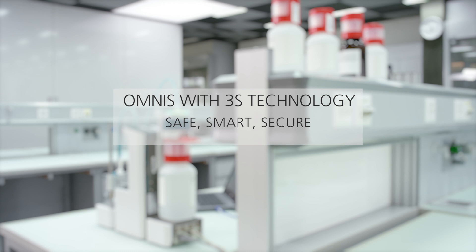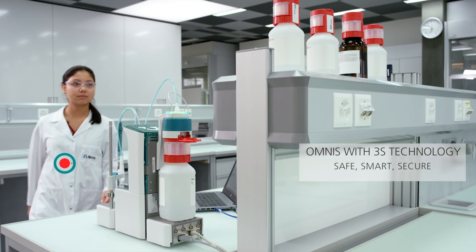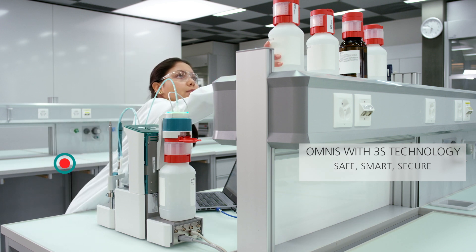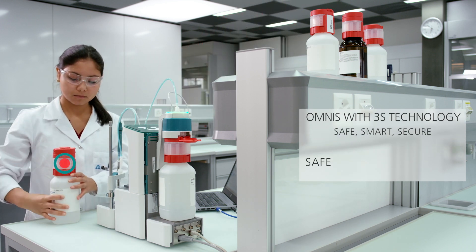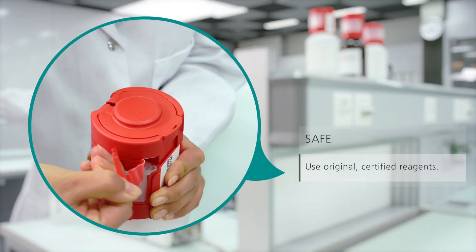Reagent Exchange. Safe, smart and secure. Exchanging reagents for titration used to include a risk of coming into contact with hazardous liquids. Not any longer, thanks to Omnis and 3S adapter technology.